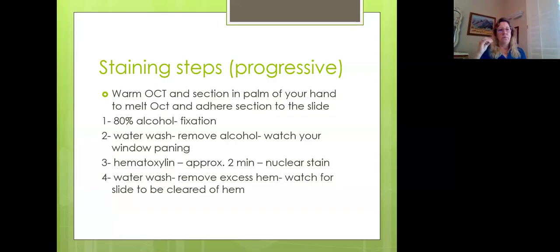Students tend to want to use a rack to go through their stain line. Don't. It takes up way more time and has much more carryover. Hold the slide in your hand. Hold it on the label. It's so much more efficient.